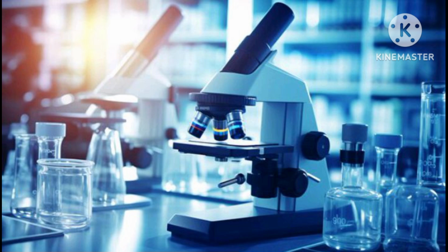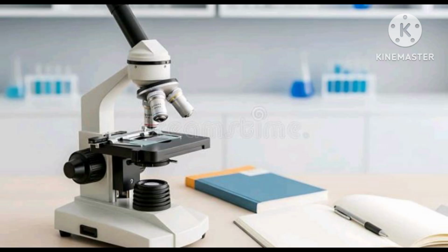It is usually expressed in the form of an image magnified tenfold. The resolution of a microscope is a measure of the smallest detail of the object that can be observed. Resolution is expressed in linear units, usually micrometers.